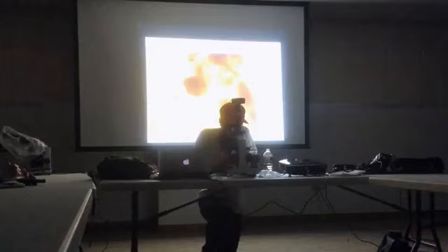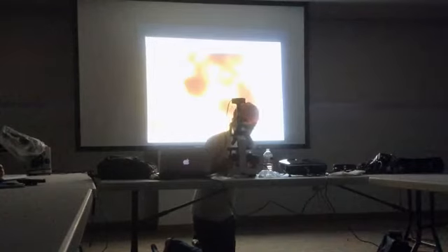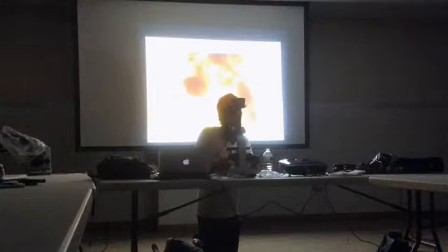And then sometimes here, can you see what I'm doing? I'm scrolling in and out. I'm zooming in and out. And when you find a fungus, you want to kind of zoom across it to make sure that the edges are parallel the whole way, because then you know it's actually a fungus and it's not just like an antenna or a leg or something else. They tend to be more round.